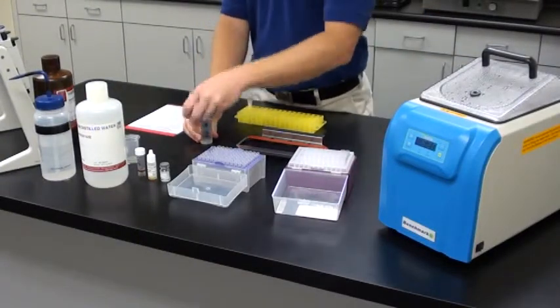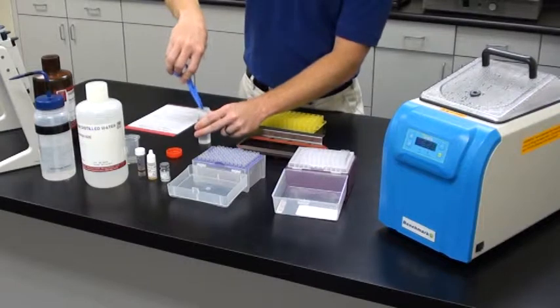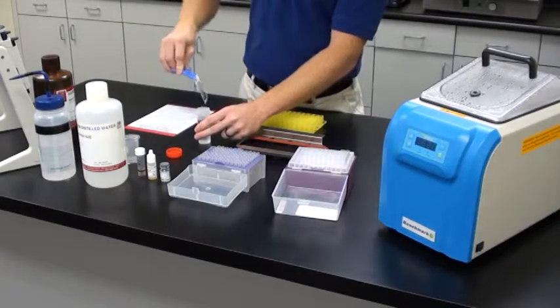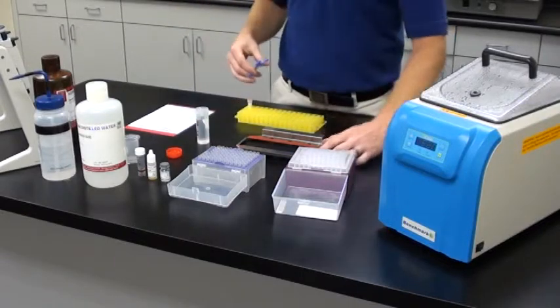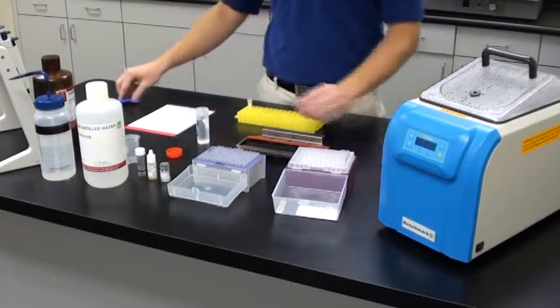The test we're running today is the Kappa light chain and requires a hybridization time of 60 minutes. Be sure to check your protocol as different probes have different hybridization times, but 60 minutes is the longest.